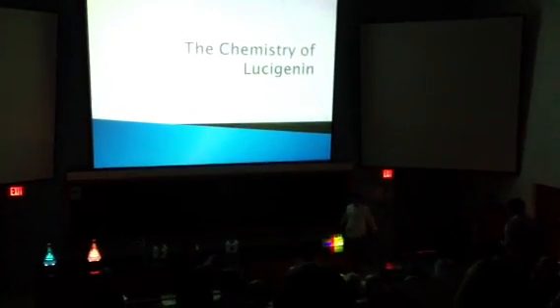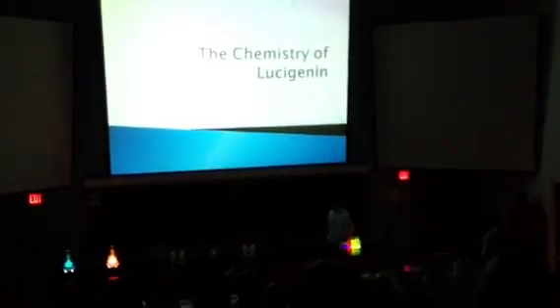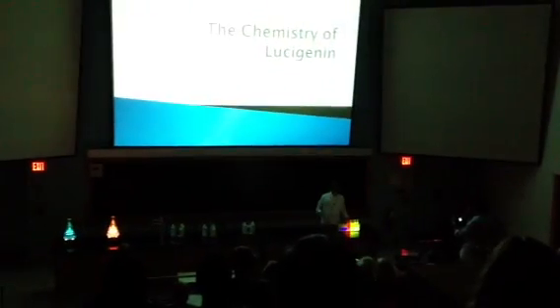You will be demonstrating how light can be emitted through the decomposition of lucigenin and how this light can be used to set off other reactions. Take it away, Matt. Okay, I'm Matt Bierowski, as you said, a student here.